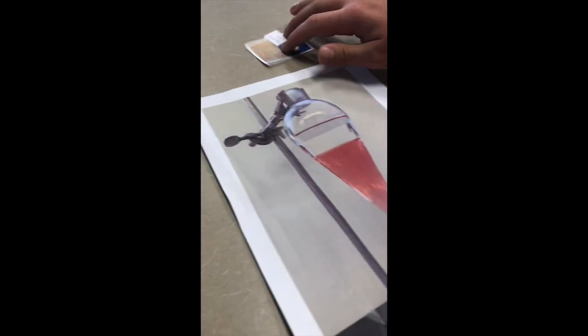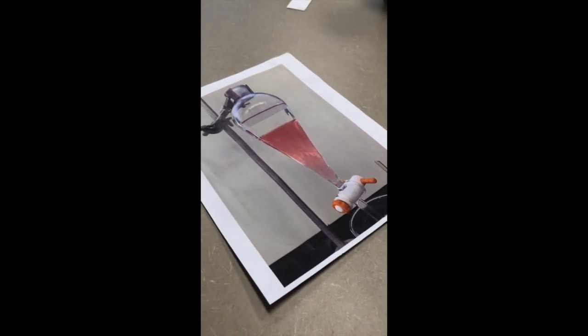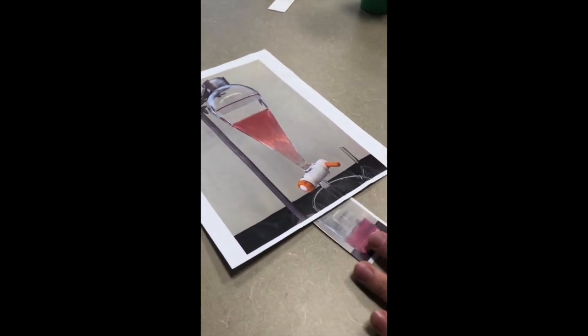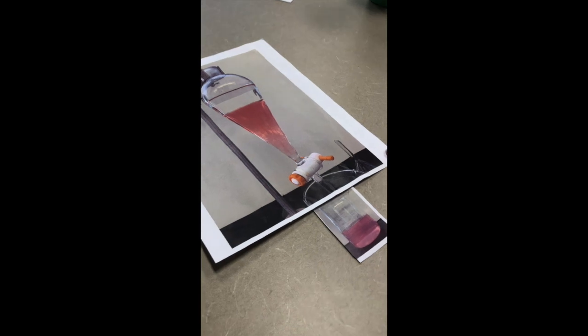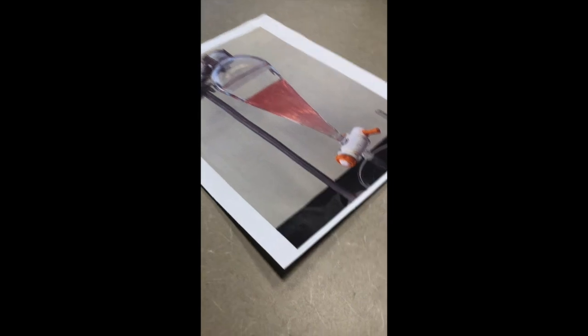And now with that organic layer, we're going to add some sodium chloride. And this is going to cause some initial drying. Once again, we're going to mix it, and then we're going to add it back into that funnel again. And then we get another 2 layers, and we're going to take out that aqueous layer again because we don't need it. But we're also going to take out the interface because that is no longer needed. And then we are going to take out our organic layer from the top.